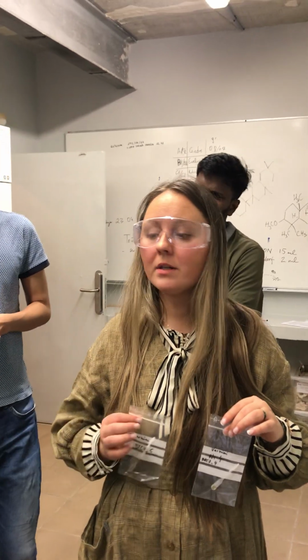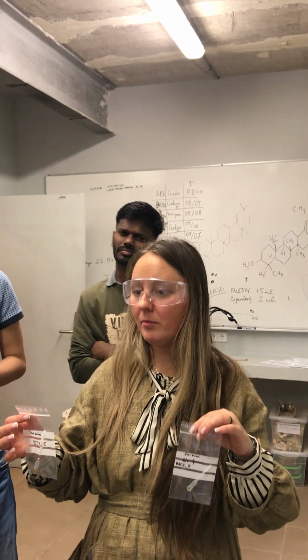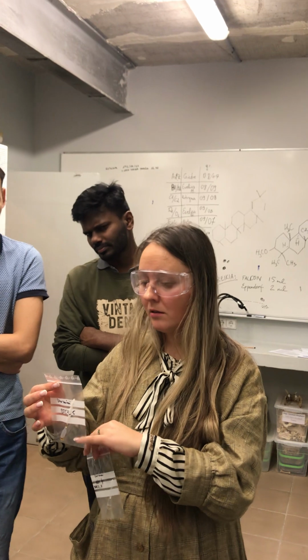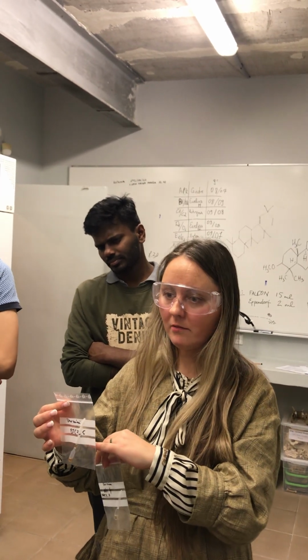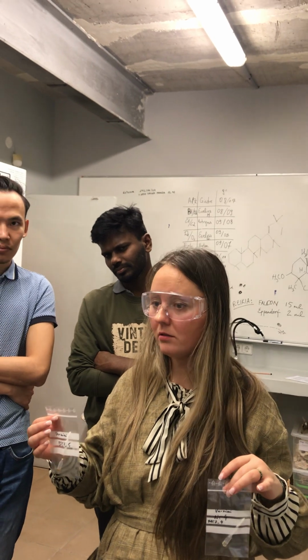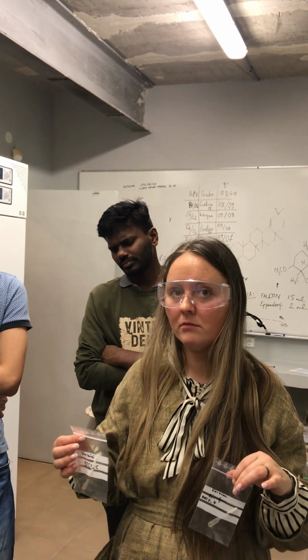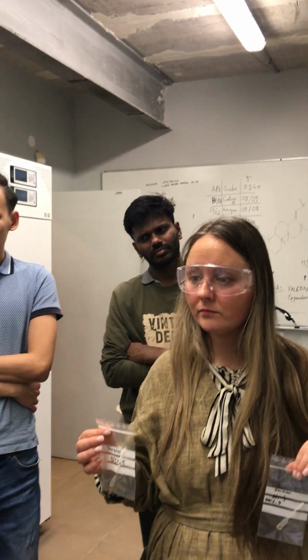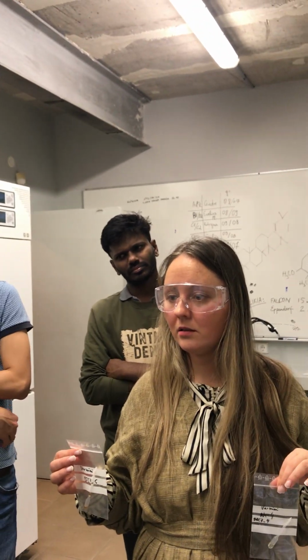There are also many ways to prepare the sample. For example, we might want to evaporate the alcohol and then use water instead of alcohol as the solvent, or use physiological buffers and measure it. Tell me exactly if you have enough, and this is for now, okay? I could give you more in the future.